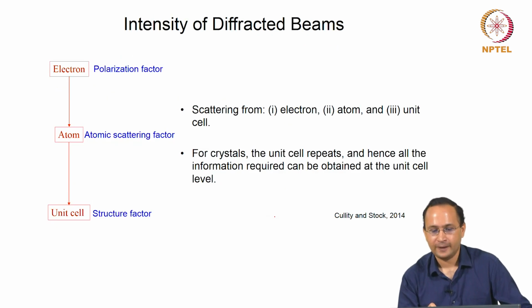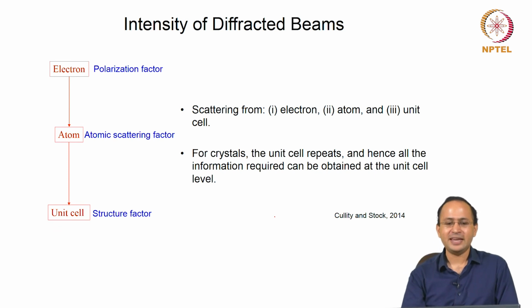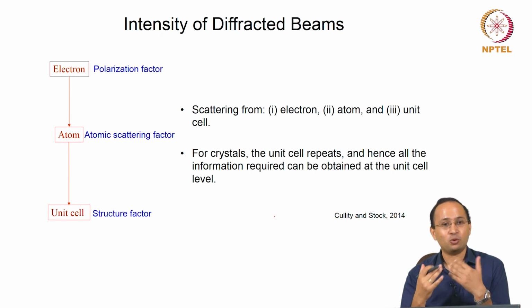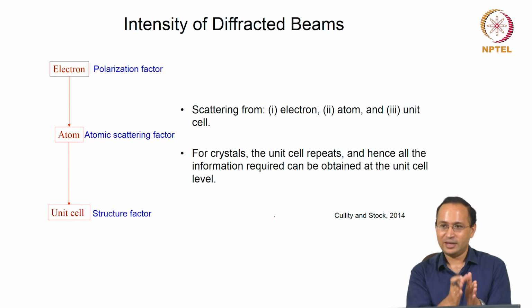Okay, I think we will pick it up from here, but in the next lecture, what we will see. So far we know about the diffraction, we know where Bragg's law is satisfied. Now the question comes, what happens to the intensity, because eventually we want to get a pattern. In X-ray diffraction, we want to get a pattern, and first of all, we can get the locations, the positions.